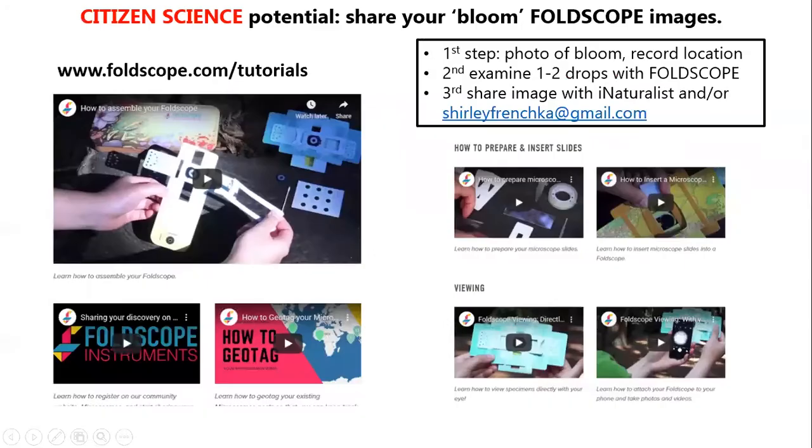Before I get started with sharing a lake sample on the foldscope, I would like to point out that there are many excellent YouTube tutorials available from foldscope.com. If you want to know more about how to prepare or insert slides, to finding out what people around the world have been looking at with their foldscopes, or if you just want to register your own scope, I highly recommend that you visit their website.